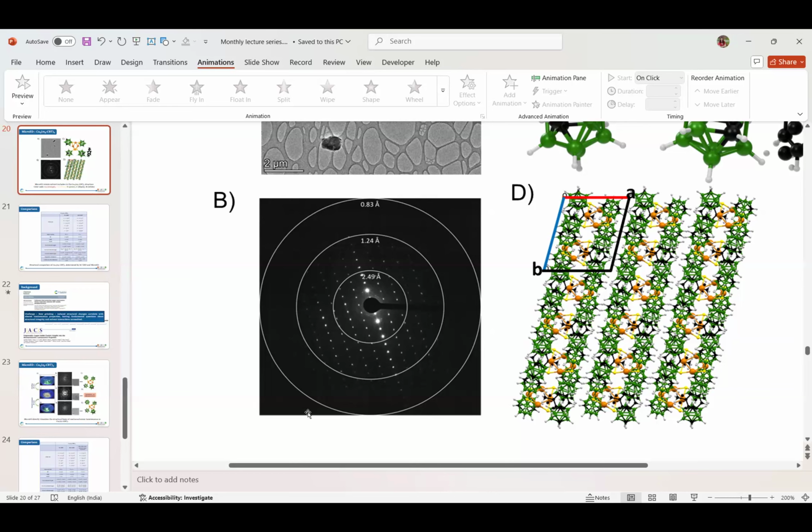So that's the resolution. 0.83 means that if an atom is placed at a distance of 0.83 Angstrom, you can see it. It's very close, that's why we are seeing the structure so closely. That's why the paper in Science published the location of hydrogen in paracetamol. They could see the hydrogen atom in the diffraction with improved resolution, the carbon and hydrogen, and oxygen and hydrogen. These things are referring to that.